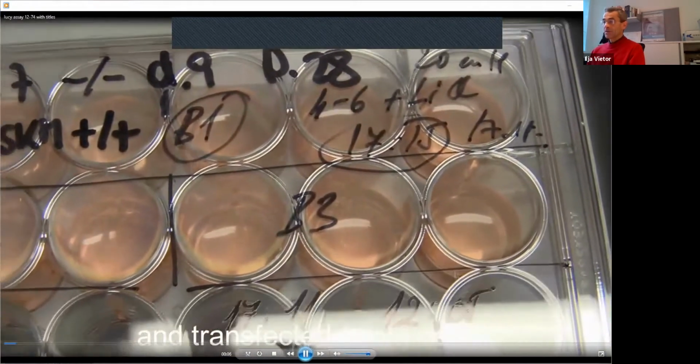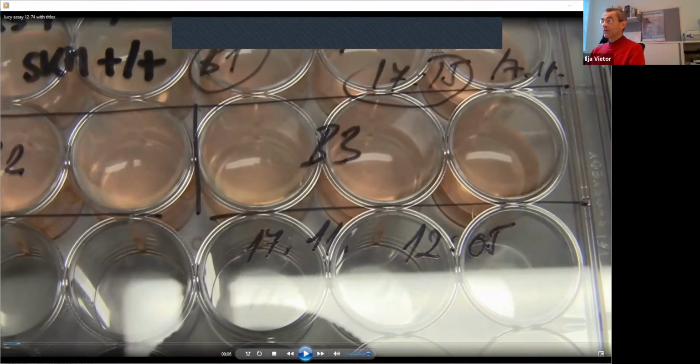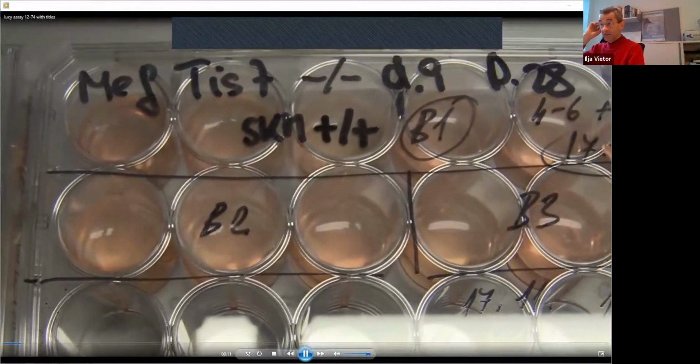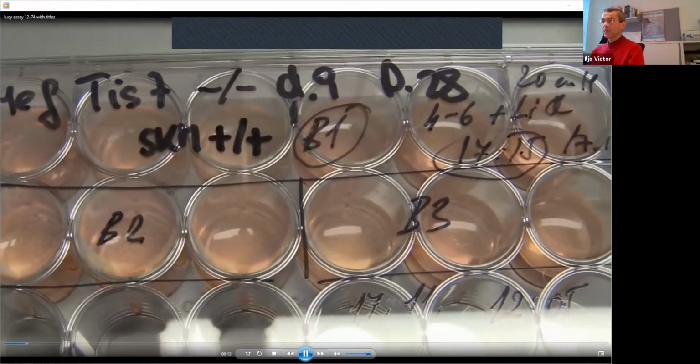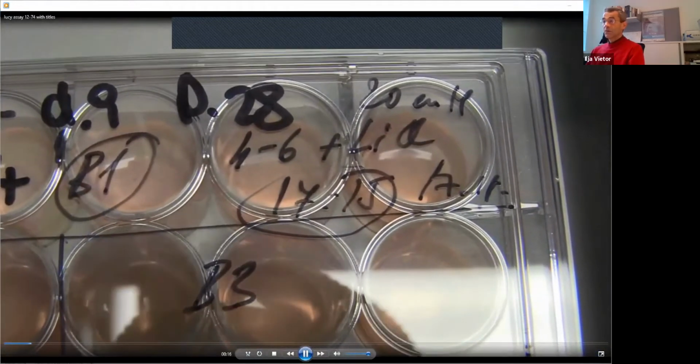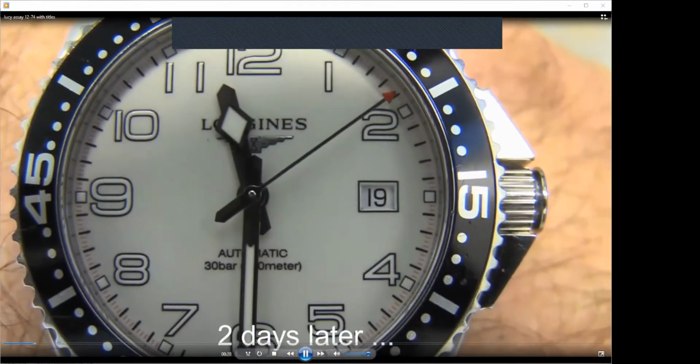This is the plate which was transfected. Next thing is that here was added 1 day later than the lithium chloride. And on the bottom are samples which were transfected with 2 different. So this is on 19th.